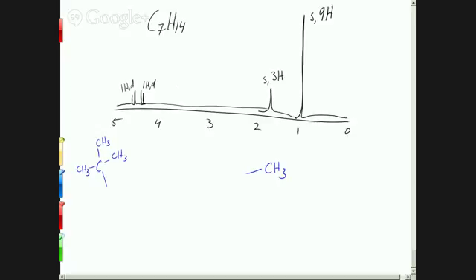Right, so one thing we can look at is this chemical shift. We see that those doublets are between 4 and 5. And if we look at one of those tables, we'll see that things that show up between 4 and 5 are hydrogens that are on double bonded carbons. So that might be what our double bond is. If we had 2 double bonded carbons like that, those two could split each other. And then that might give us these, right? They're each 1 hydrogen, and then they have 1 neighbor as well.